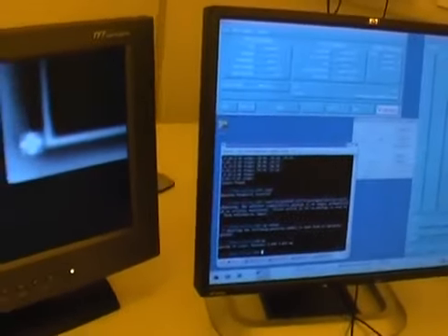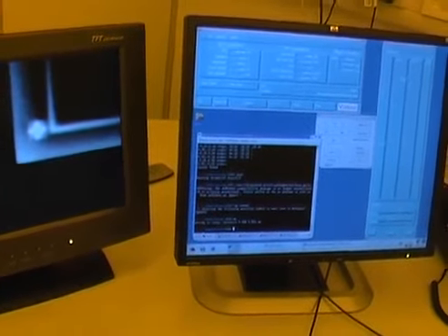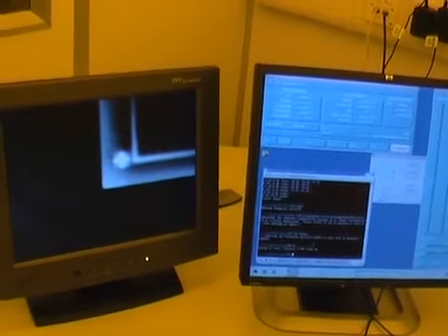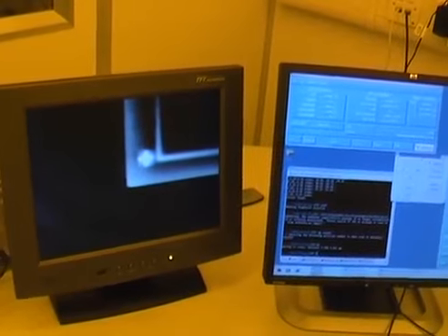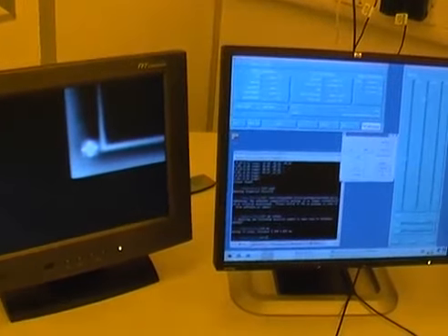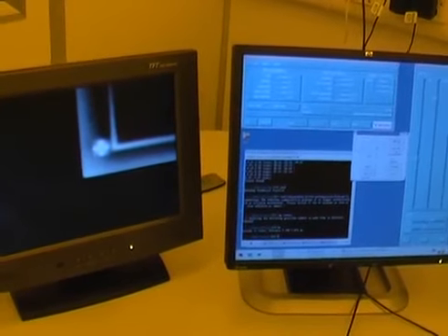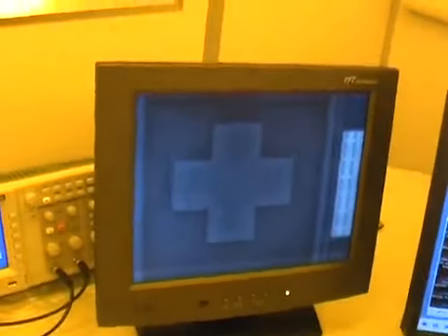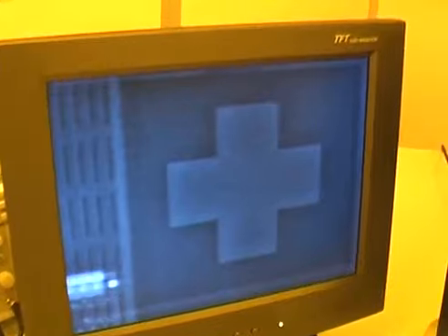And this is the distance which the user has measured in the Zeiss optical microscope, which should take me exactly to the cross. So if I switch the joystick on now, I should see it. I'm going to zoom out a little bit, switch on the joystick, and you can see straight away I'm at a cross. Just need to center it. I need to zoom in.